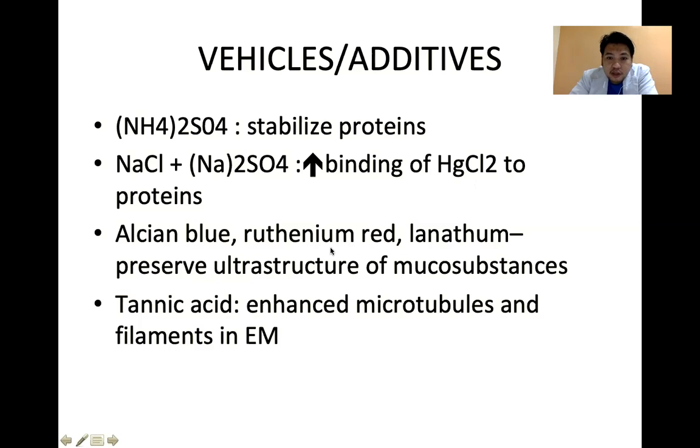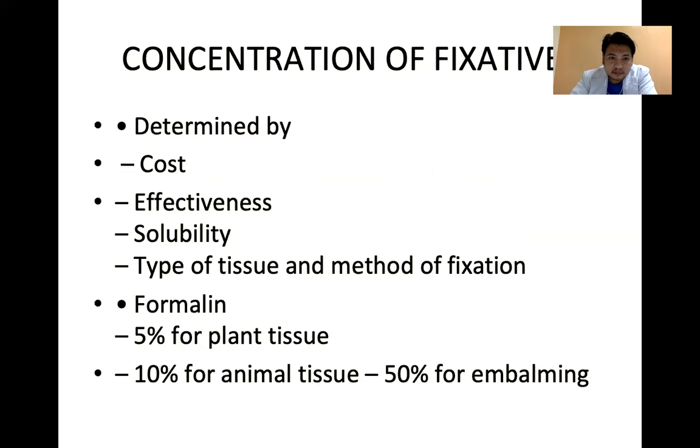Alcian blue, ruthenium red, and lanthanum preserve ultrastructure of the mucous substances. Tannic acid enhances microtubules and filaments in electron microscopy. Tannic acid also precipitates protein for fixation.